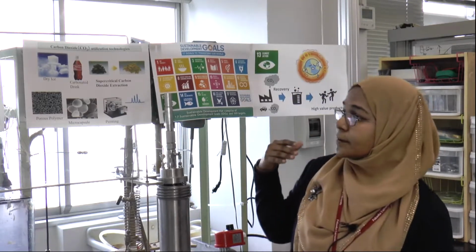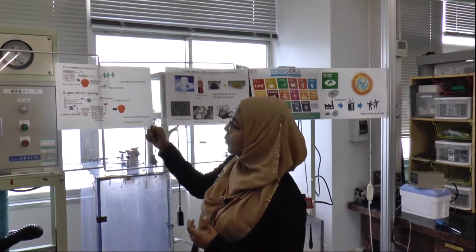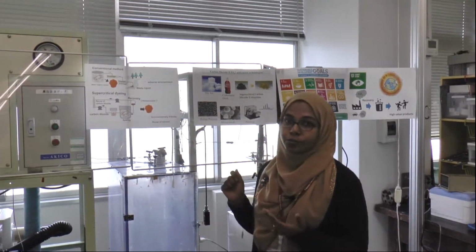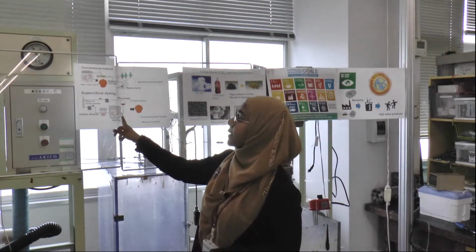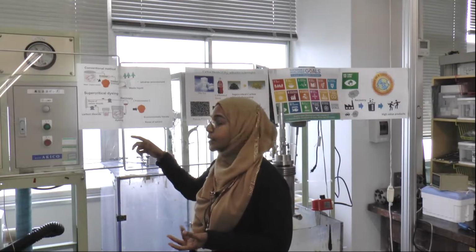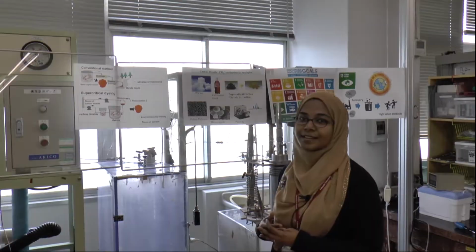And the importance of using supercritical carbon dioxide is we can use this as an alternative to conventional toxic organic solvents. And in this case, we can use it for dyeing or extracting things and then recover this carbon dioxide. The whole thing is recycling carbon dioxide.